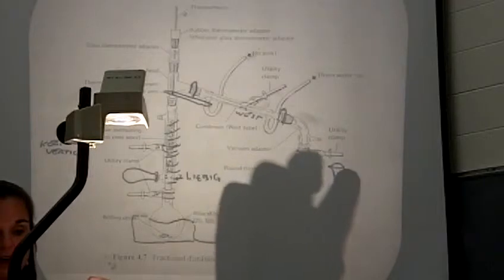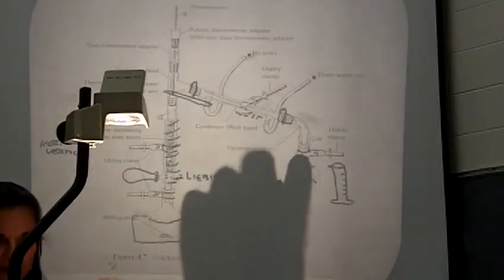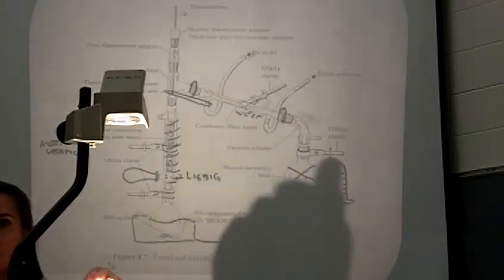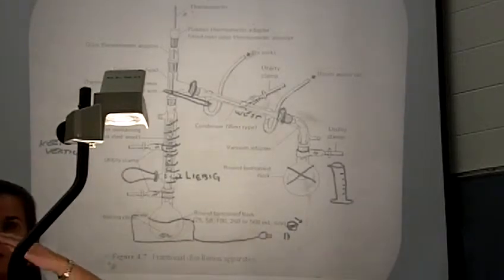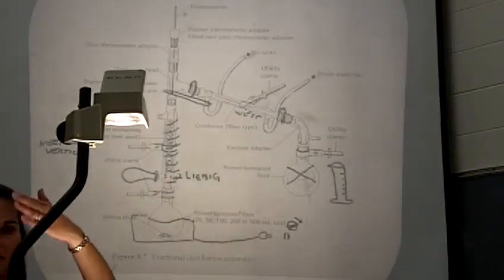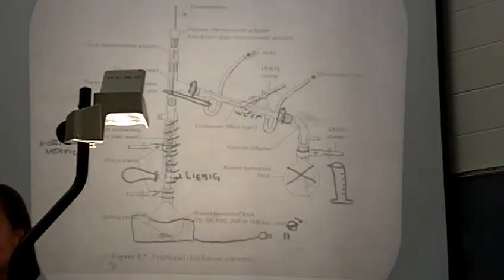Also, when you're clamping the graduated cylinder, be careful. A lot of the vacuum adapters have this little tip that goes down below the adapter. So when you're exchanging grad cylinders out from each other, in and out, you don't want to clip off that tip, okay? So be careful how you clamp things, and be careful when you are exchanging things. First lower the graduated cylinder and then pull it away and put the new one in place, all right?